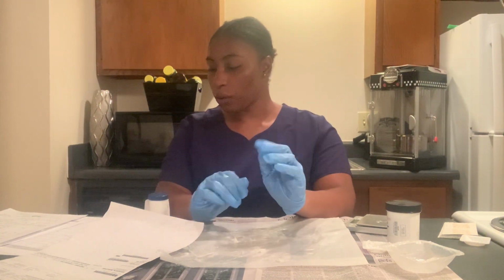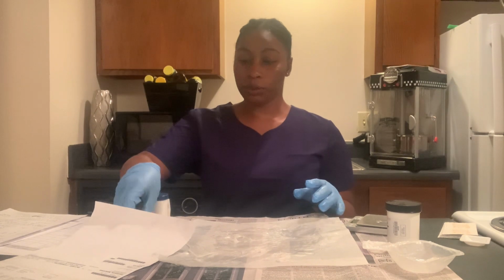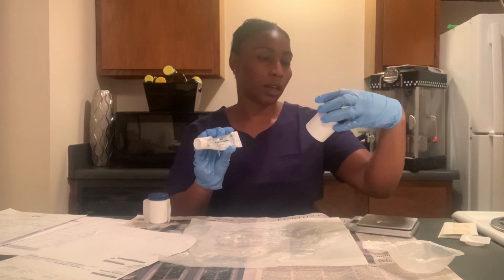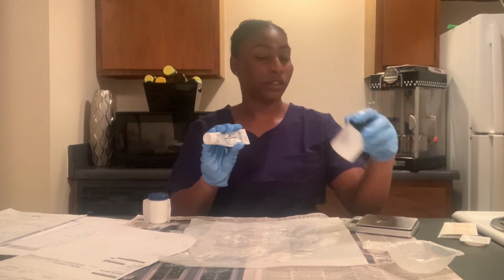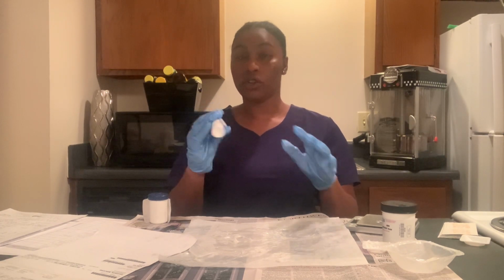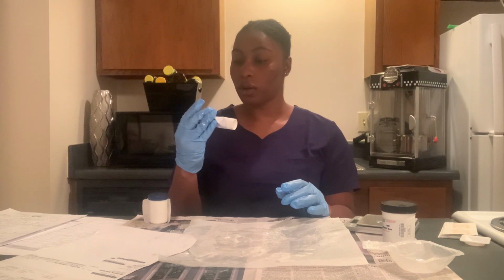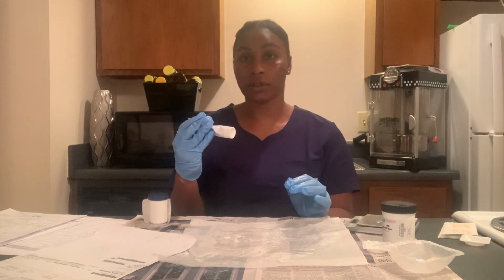Okay, so and then the next step would be complete the compounding record. So you'll have to write down both prescriptions, so the nitroglycerin ointment and then the ointment base. You'll have to write down the dosage, the NDC, so National Drug Code, the number on the compounding record.